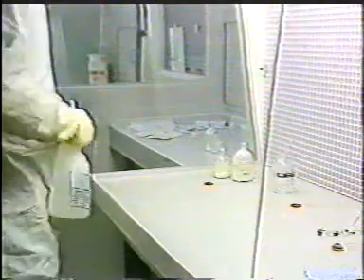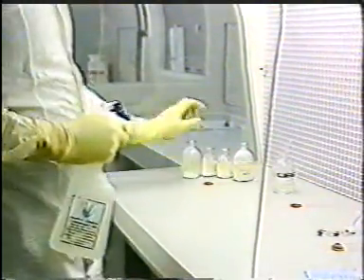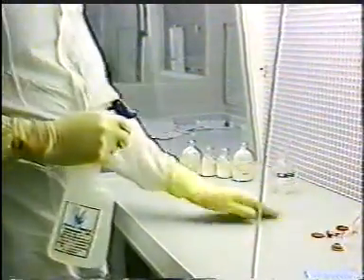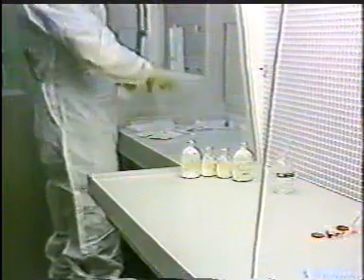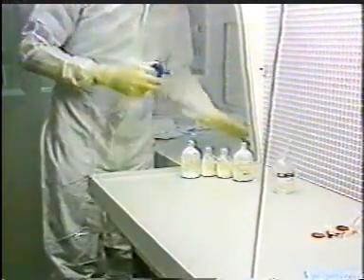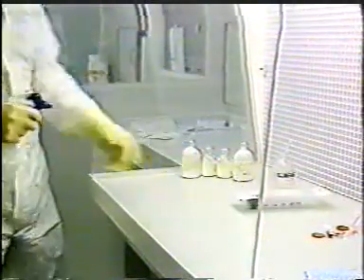Both classes of rooms should have a minimum of 20 air exchanges per hour. Laminar flow cabinets are used to give a local Class 1 environment where required. The requirements for non-sterile manufacture rooms are of course less stringent. The determination of the number of air changes per hour is carried out at regular intervals by quality control staff.